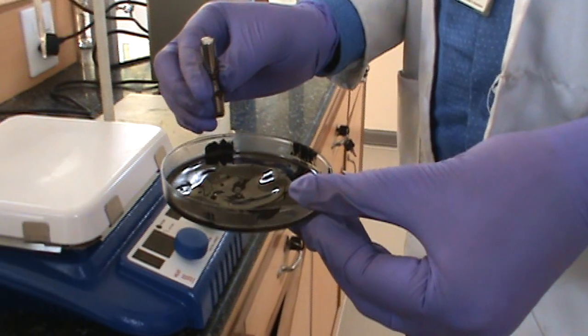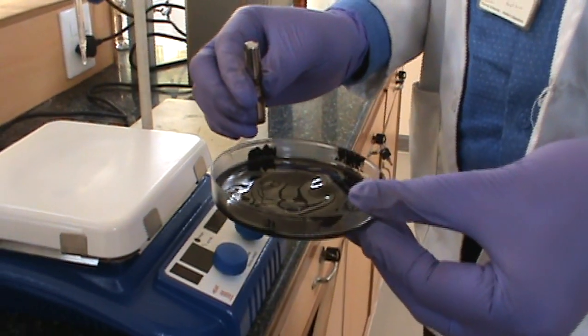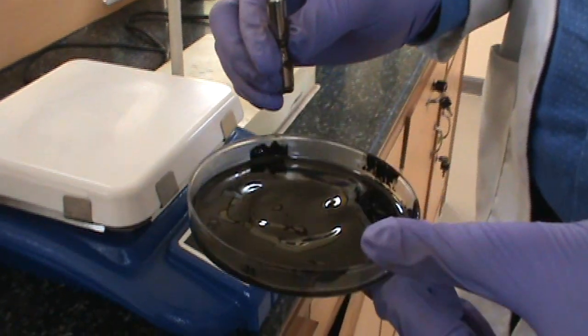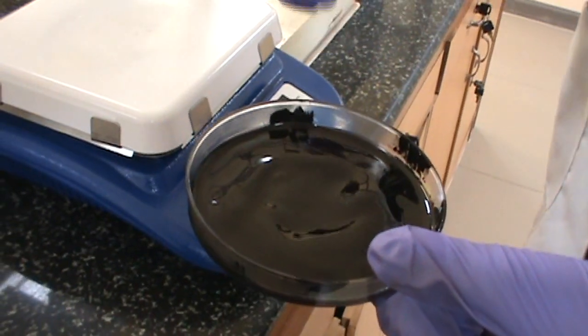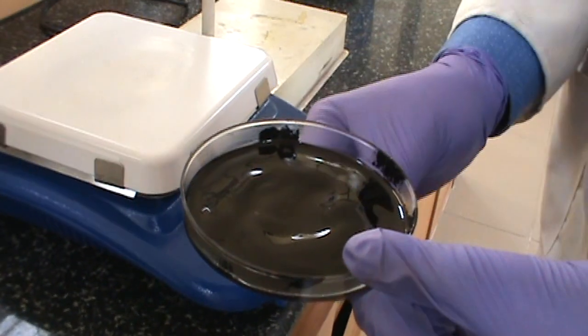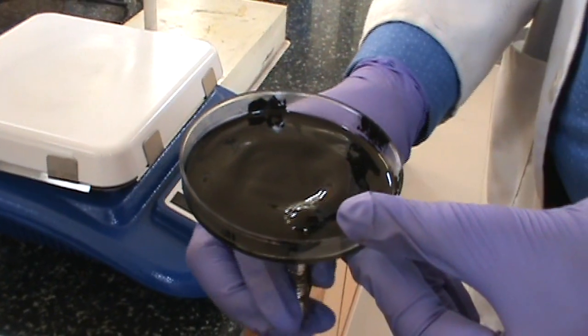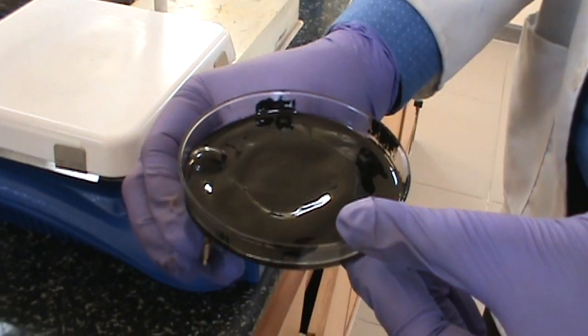We filtered out the iron oxide nanoparticles, dried the sample, and then mixed it with oil. Now you can see we have a magnet here and these particles are magnetic and they can be used for various applications where ferrofluids are used.